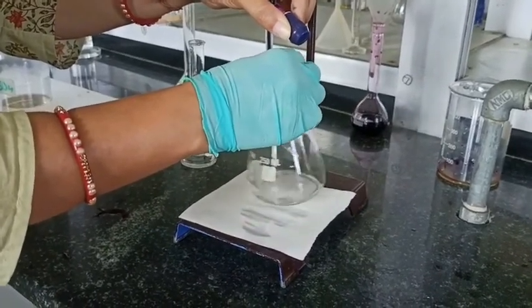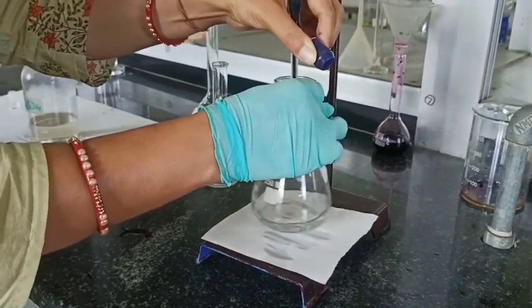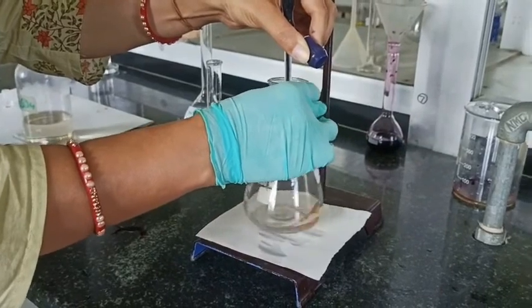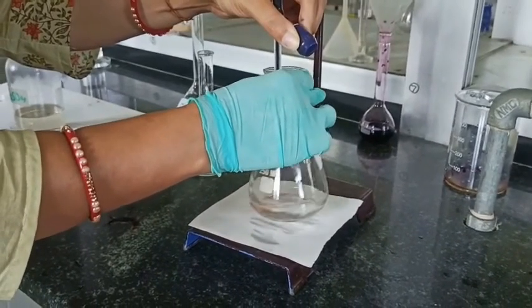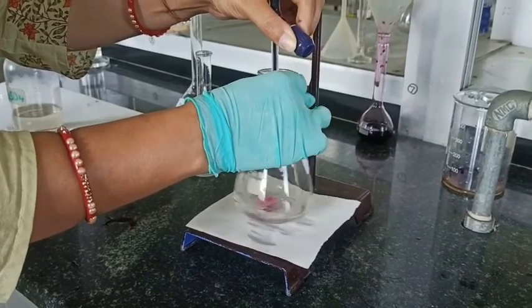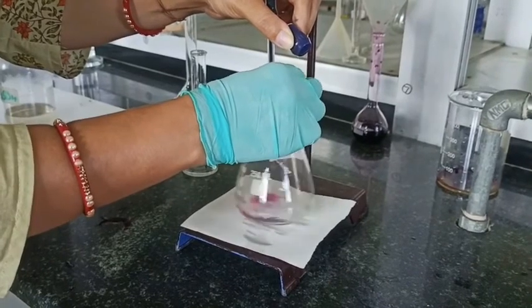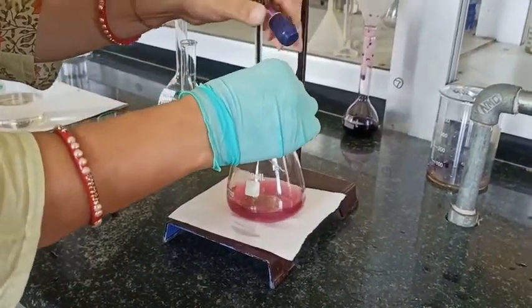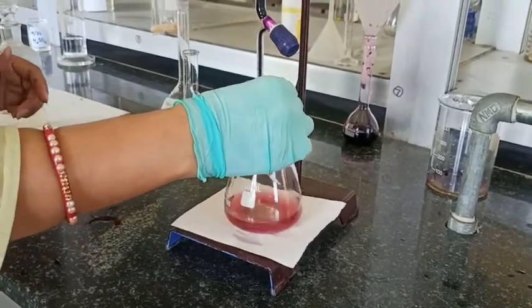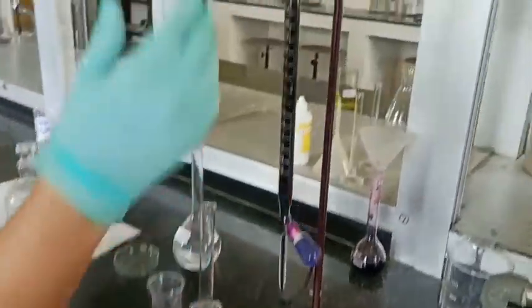The disappearance of the KMnO4 color suggests that oxalic acid is still present, and at the end point, since all the oxalic acid, the reducing agent, is finished, the extra drop of KMnO4 will not get reduced to MnSO4, so we will get the purple color of KMnO4. Here you can see the purple color of KMnO4. It means all the oxalic acid has reacted with the KMnO4.